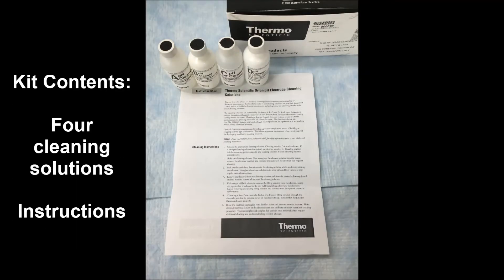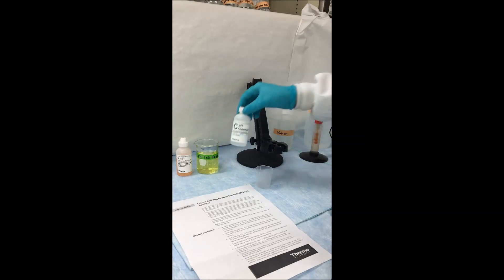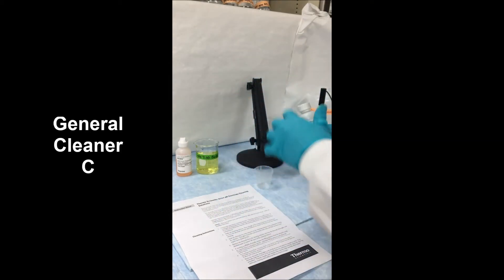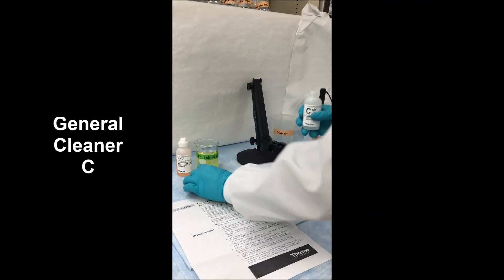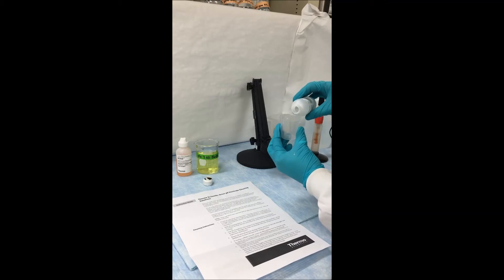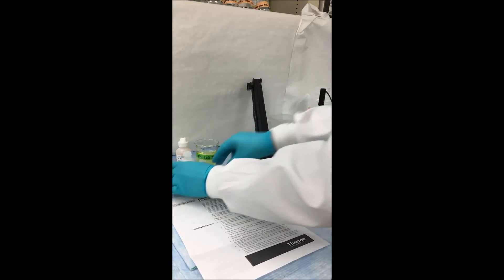Taking our cleaning kit into the lab as well as the instructions, we're going to demonstrate how to use cleaner C. Starting out in a clean lab, free of clutter, and choosing the appropriate cleaning solution, we're going to pour out a small aliquot of cleaner C into a beaker. You want to make sure you pour out enough solution so that when you submerge the tip of your electrode in it, you cover both the junction and the bulb.